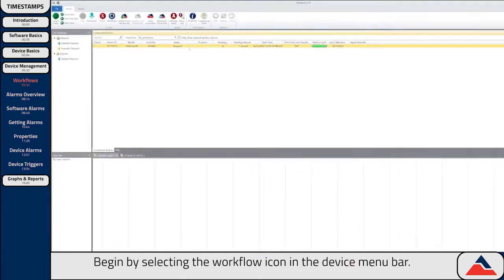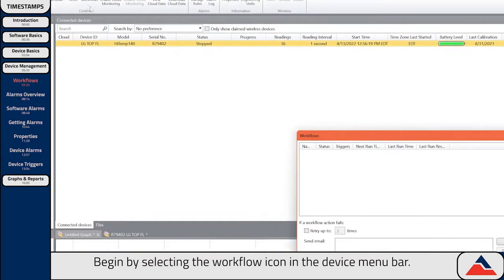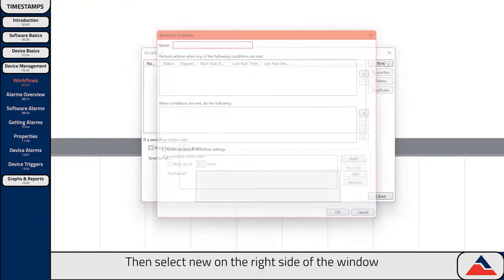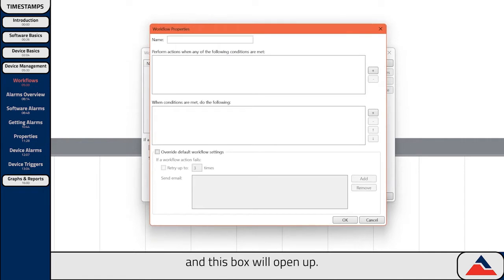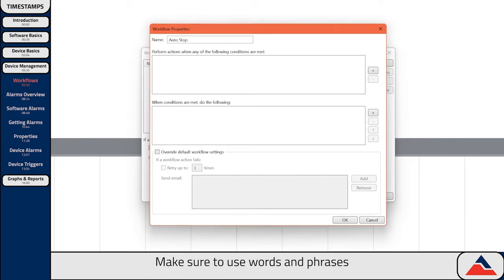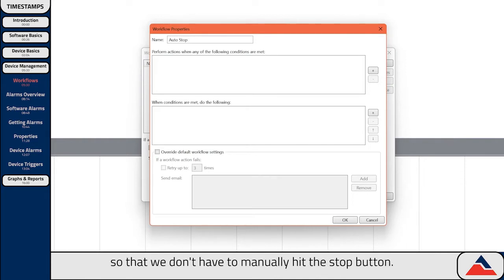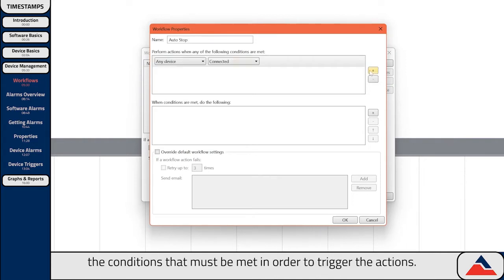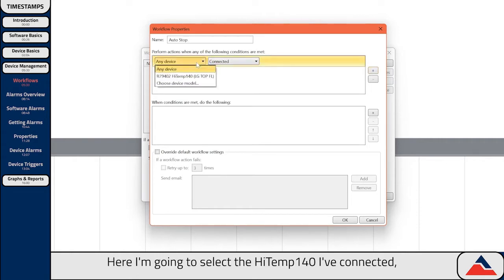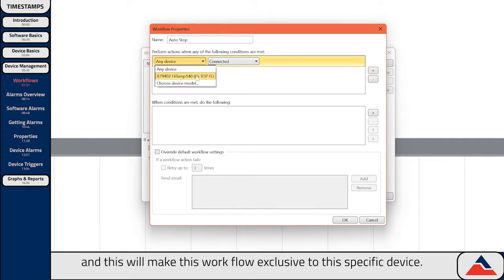Let's create one. Begin by selecting the workflow icon in the device menu bar. Then select New on the right side of the window, and this box will open up. Enter a name for your new workflow. Make sure to use words and phrases that will remind you of its function. For this example, we're going to have our device stop recording automatically when it connects, so that we don't have to manually hit the stop button. Next, select the conditions that must be met in order to trigger the actions. Here I'm going to select the High Temp 140 I've connected, and this will make this workflow exclusive to this specific device.